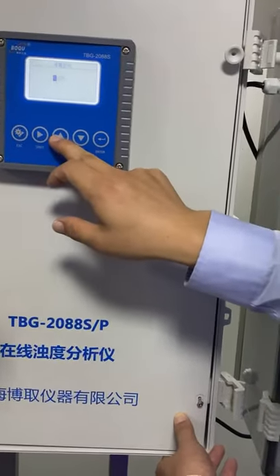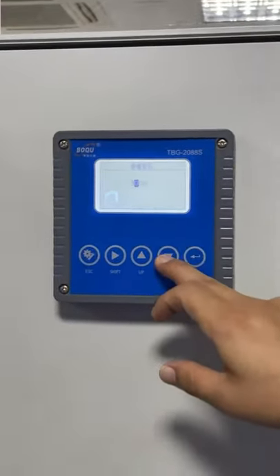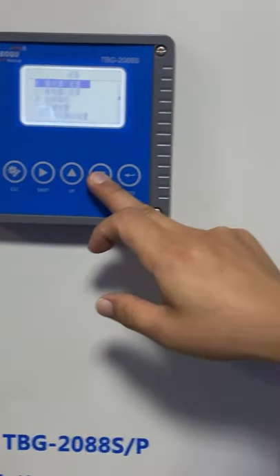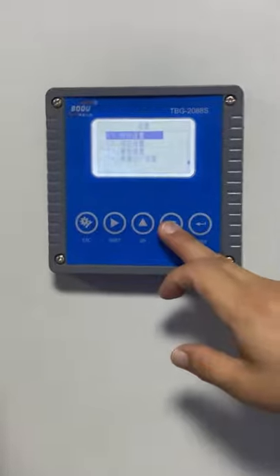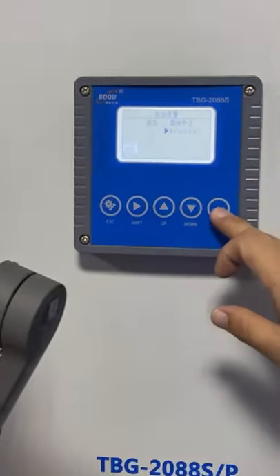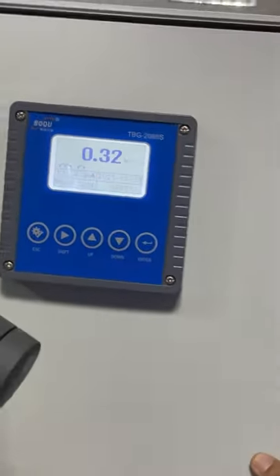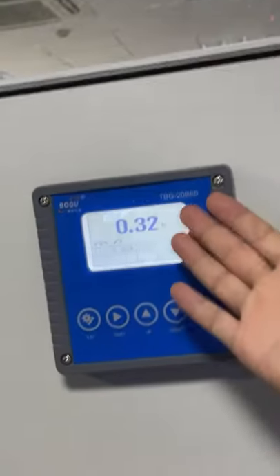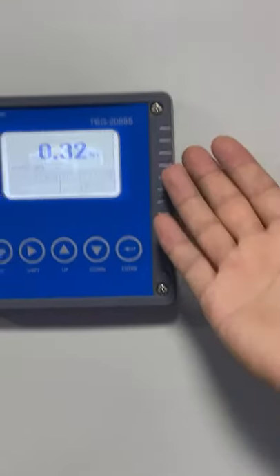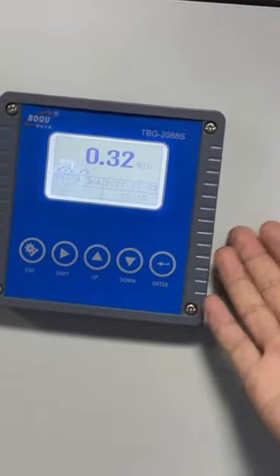Now we import the password. Password is 3700. Okay. Change is, we choose English. Now you can see zero the solution, the limit is 0.01 NTU, very accurate.